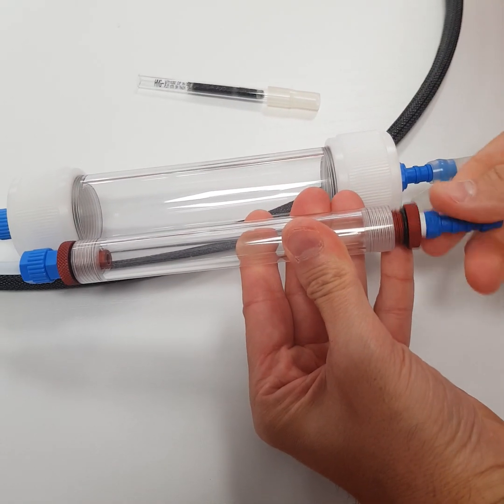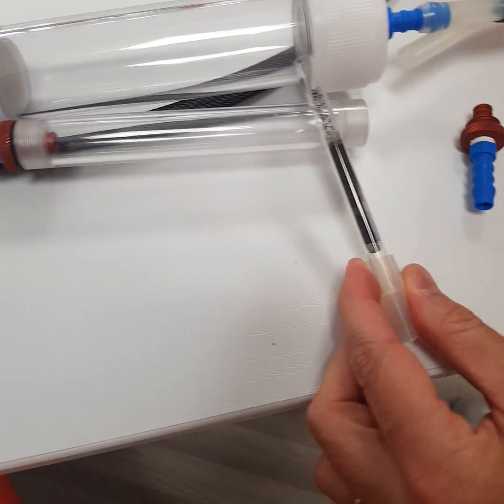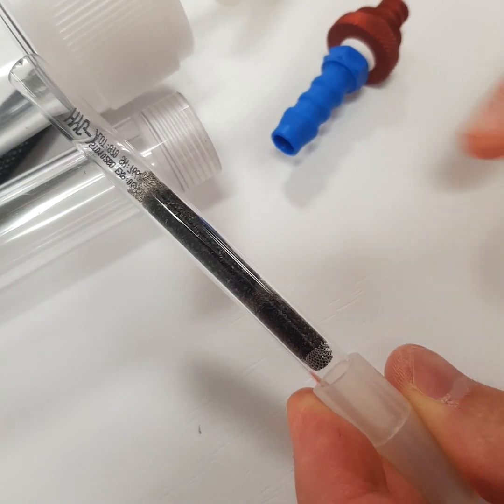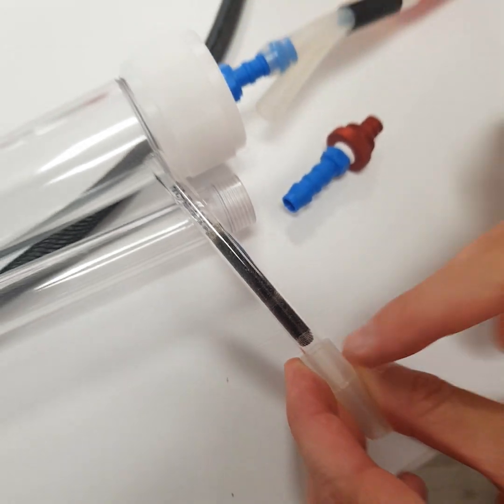We will open it and please check the direction of the flow. You have a bigger amount of charcoal and one little one. This side is for the sampling and this side is just for the backup. Please take care of this.